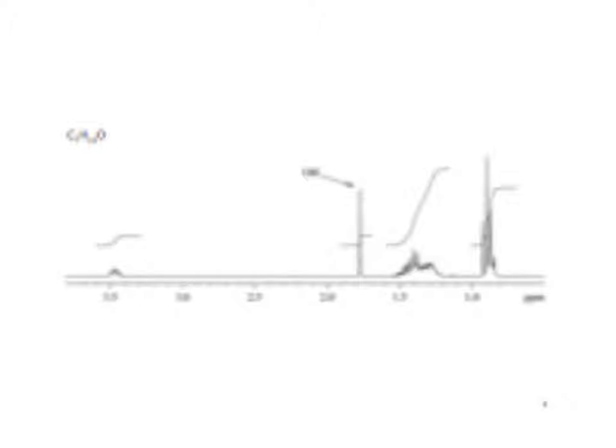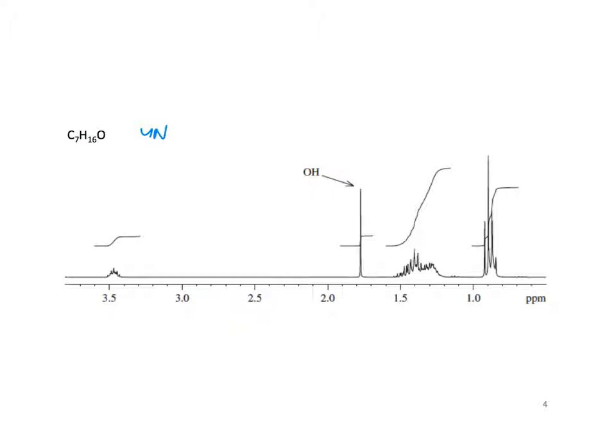So how many unsaturations on this one? None, right? So it's already giving us that there's an OH. So our task is to figure out, if we have a 7 carbon piece, where that alcohol is going to be, and whether we have any kind of branching in the structure. We can tell from the left that the 3.5 is just one proton. So this looks like 1, right?